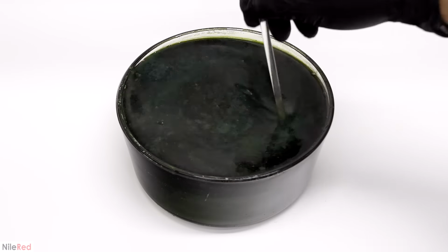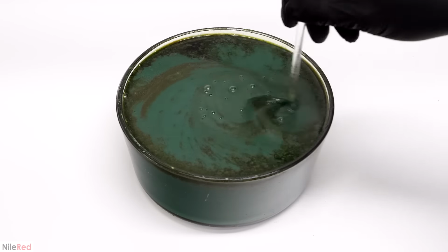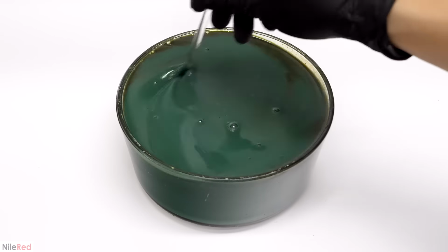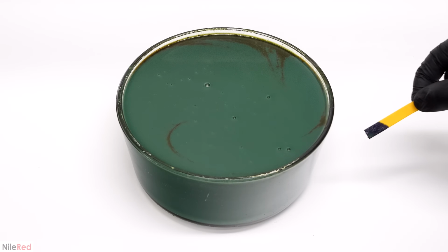I was originally planning to just bring it to the neutral point, but at the last minute, I decided to make it strongly basic. I did this because I wanted to be absolutely sure that all the acid was destroyed and that it wouldn't fume at all. When I felt that it looked okay, I tested the pH again, and this time, it was really basic.